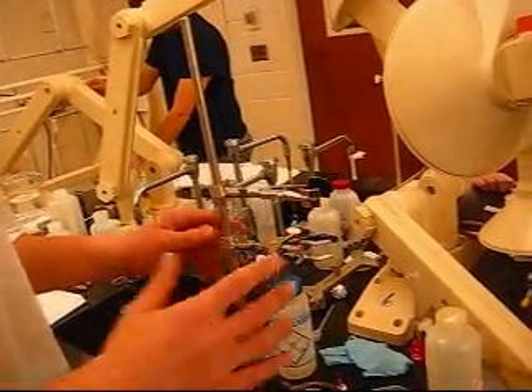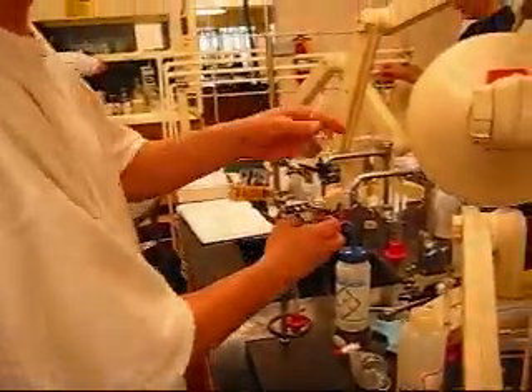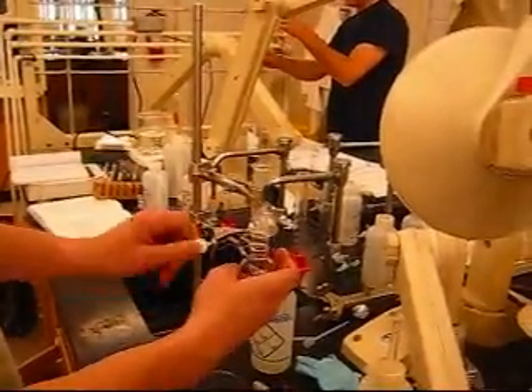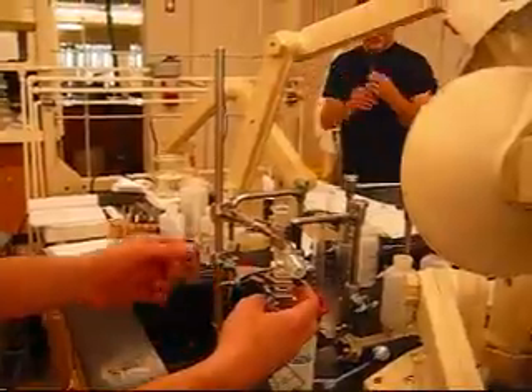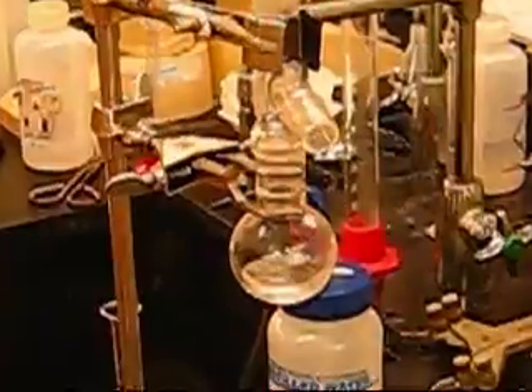This is your most important clamp. So when we set this thing together, all we're going to do is bring this together like so, and we're going to close this clamp. What you're doing is just screwing these things in, and then we do the other side.